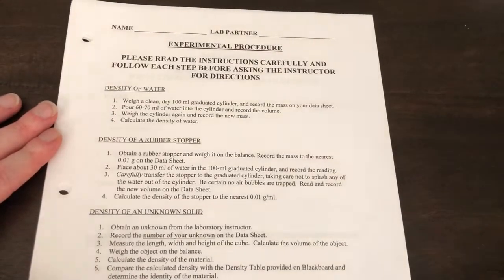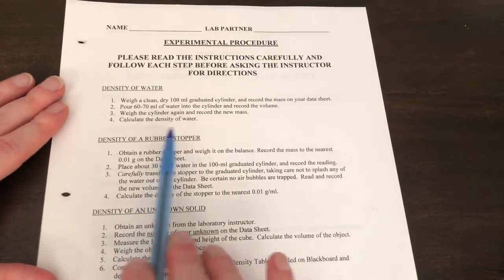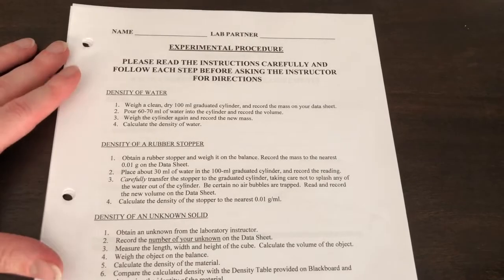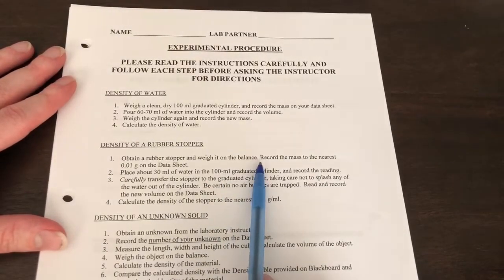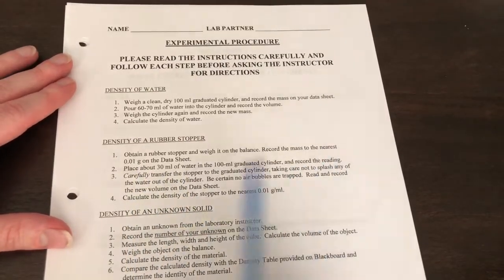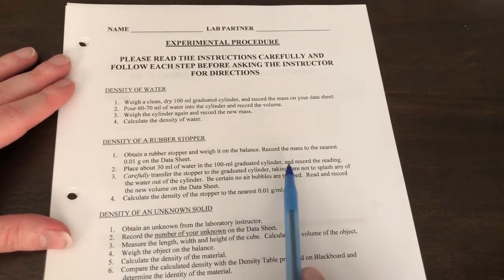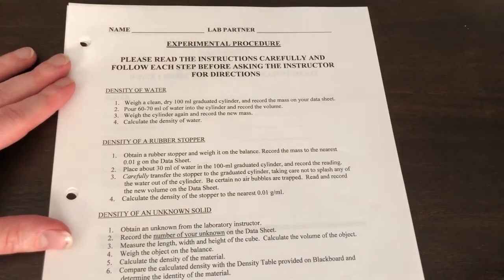Okay guys, so now we're going to go through the process for finding the density of a rubber stopper, or an irregular shaped object. We're going to get a rubber stopper, put it on the balance, and record the mass in our data sheet. We're going to place about 30 milliliters of water in the graduated cylinder and record the reading.